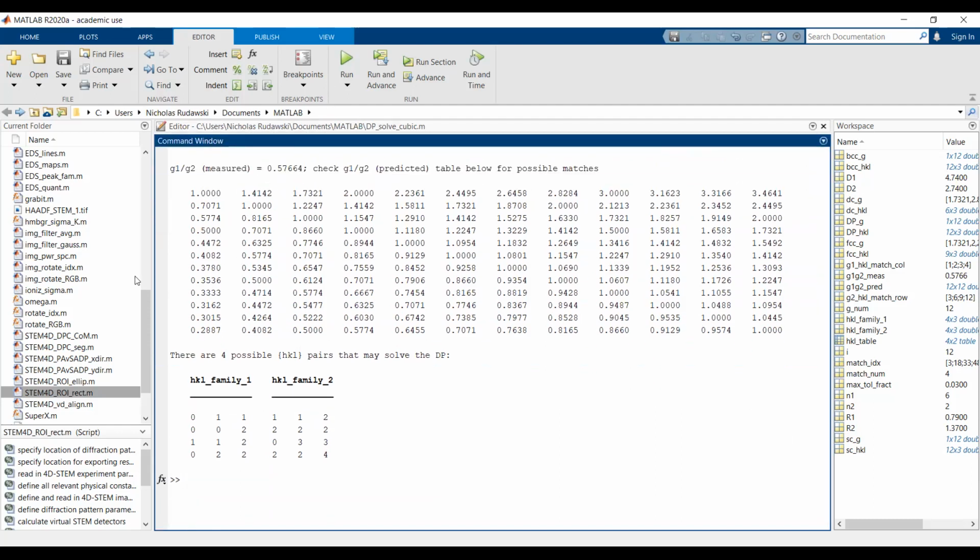We want to find in the table the close values. So there's one right here, okay, there's one right here. This one's a little too far off, so we're going to neglect that. There's one right here. This one, again, is off enough. And then there's one more right here. And then really nowhere else in the rest of these columns is there a close match, okay?